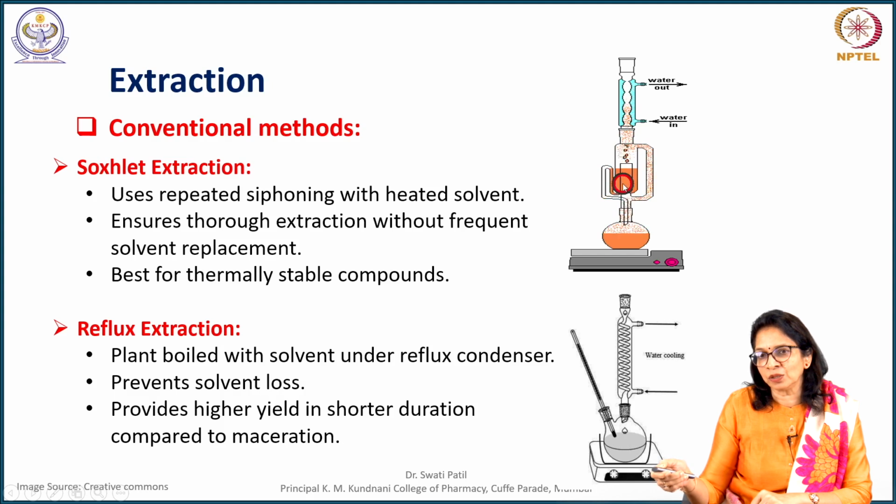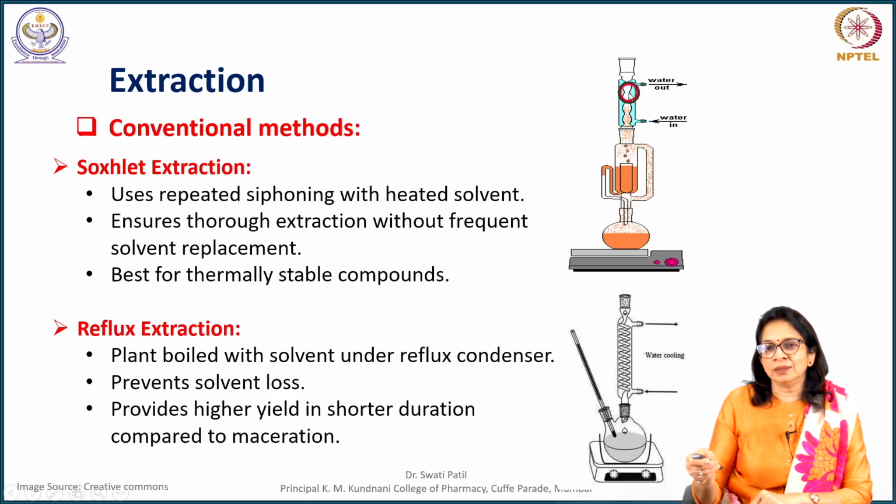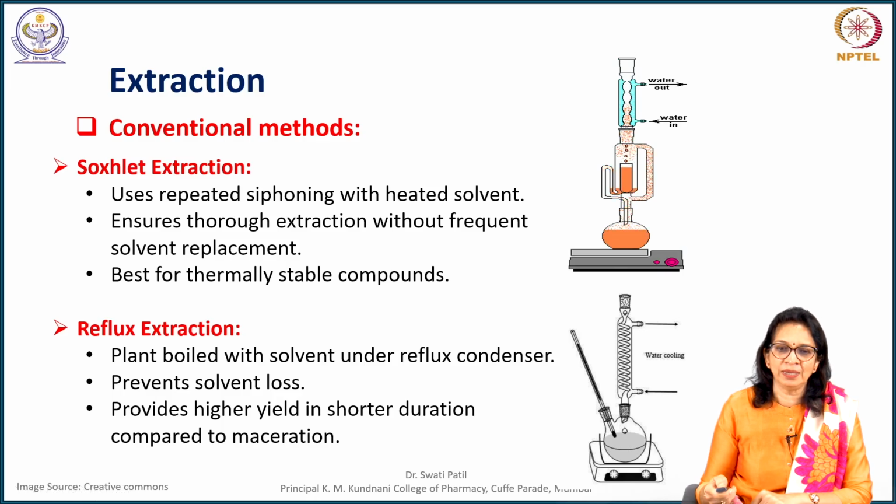So, the drug is in contact with the solvent, a process of maceration is happening, and as the solvent goes, a process of percolation is also happening. So, this is considered to be a continuous hot extraction method, best suited for drugs not destroyed by heat.